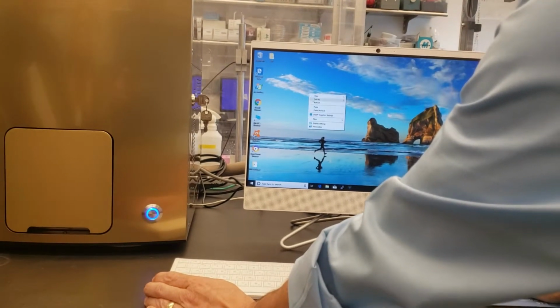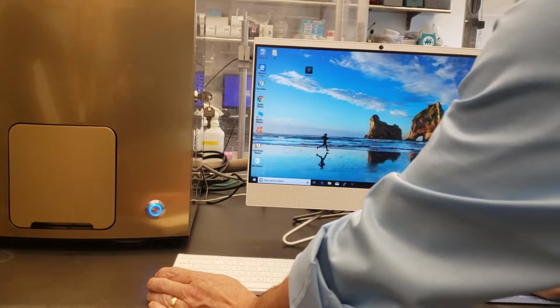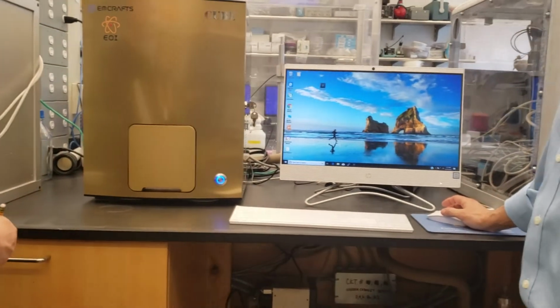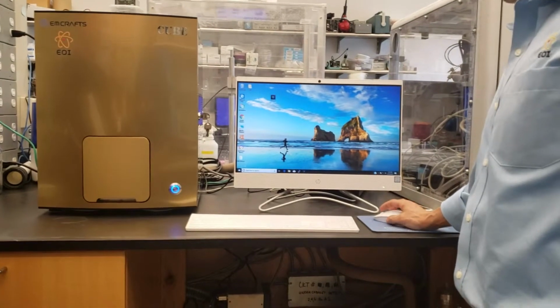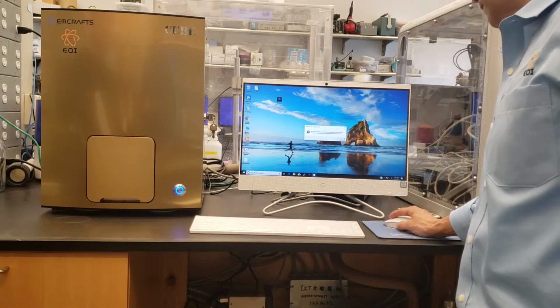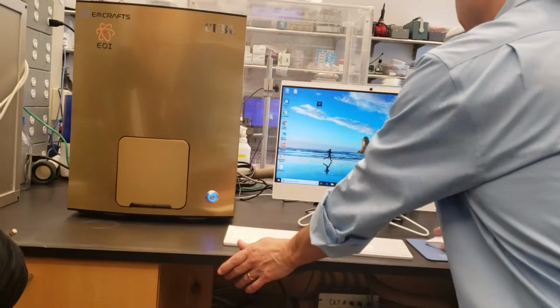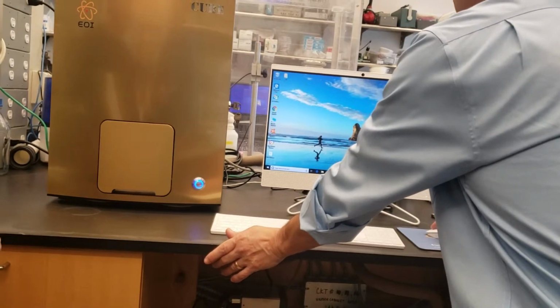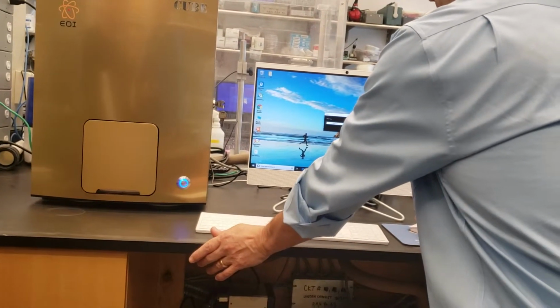And the file location, we can set it manually, right? Yes, but where is the store file? Yeah, but just leave it where it is right now. So right now, if I double click this, okay, it doesn't like the shortcut. Alright, let's just operate from there. And see, operate from taskbar.